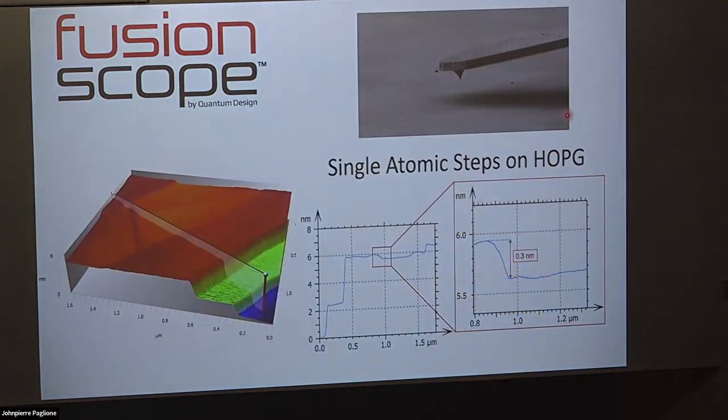And it's not a toy either, I should say. It's a very good AFM. We're able to resolve single atomic steps in graphite. So like I said, it works very well.